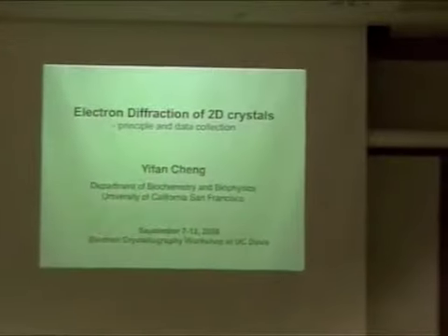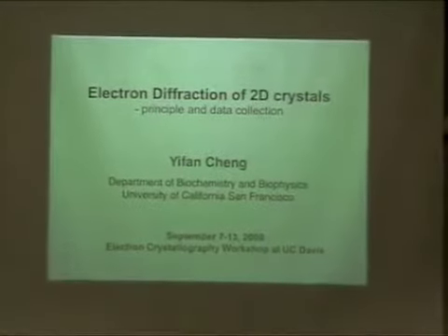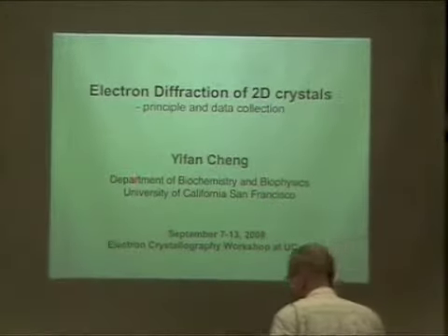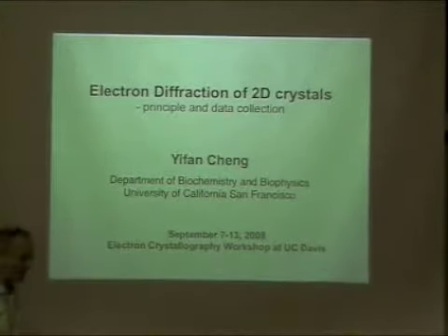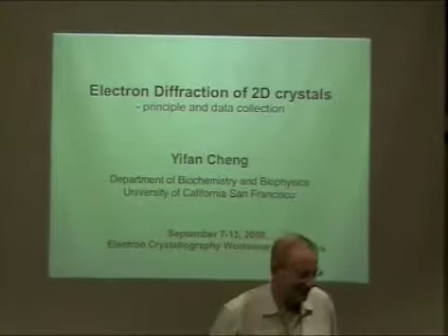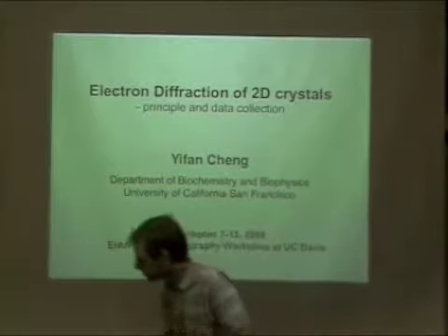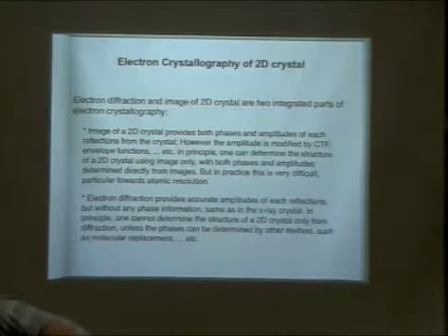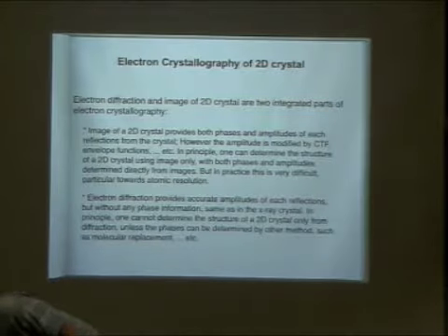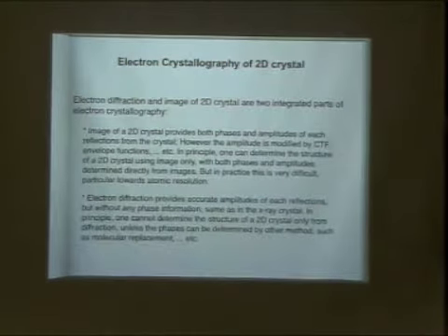Yep. Okay, so I'm going to talk about electron diffraction of a 2D crystal. Basically, for electron crystallography, imaging and diffraction are two integrated parts of this technique.